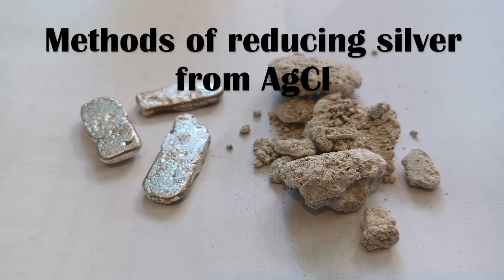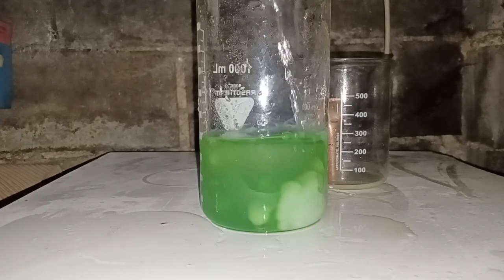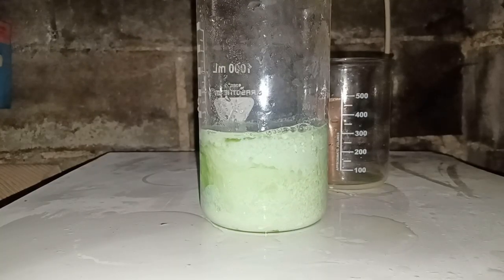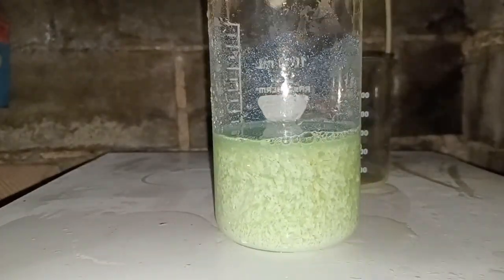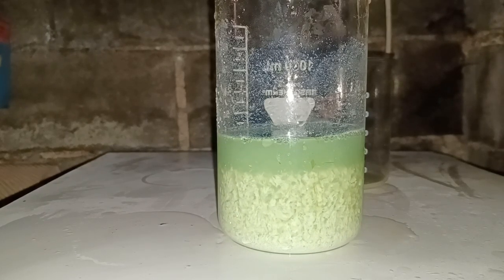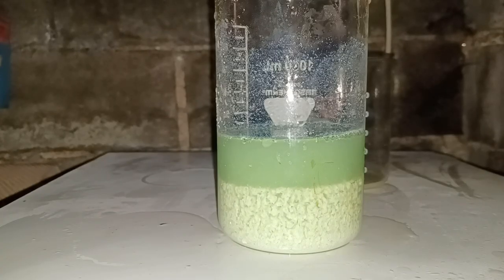Hello there. Today I'll be testing a number of ways of reducing silver from silver chloride. The easiest way of separating silver ions from a solution containing multiple different metals is by precipitating it as silver chloride. It is fast and very efficient because at 25 degrees Celsius only an extremely small amount of silver chloride can dissolve in water. But then you have to process a large volume of silver chloride to get the silver from it. There are many ways of going about it, and today I'll test and compare some of them.